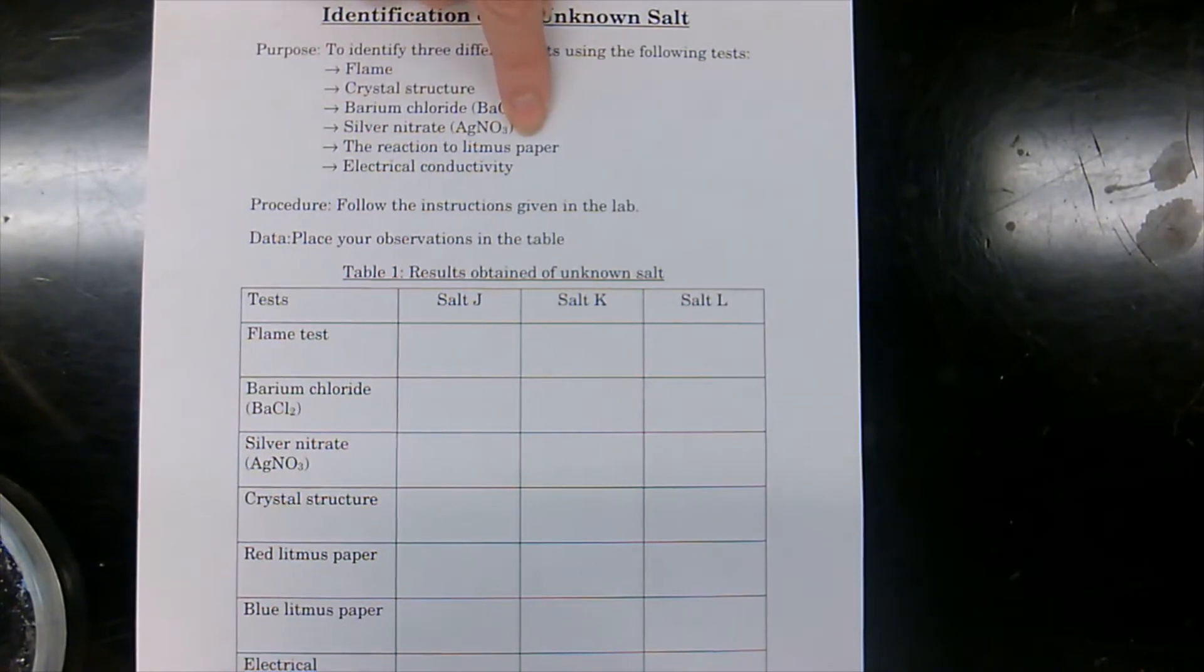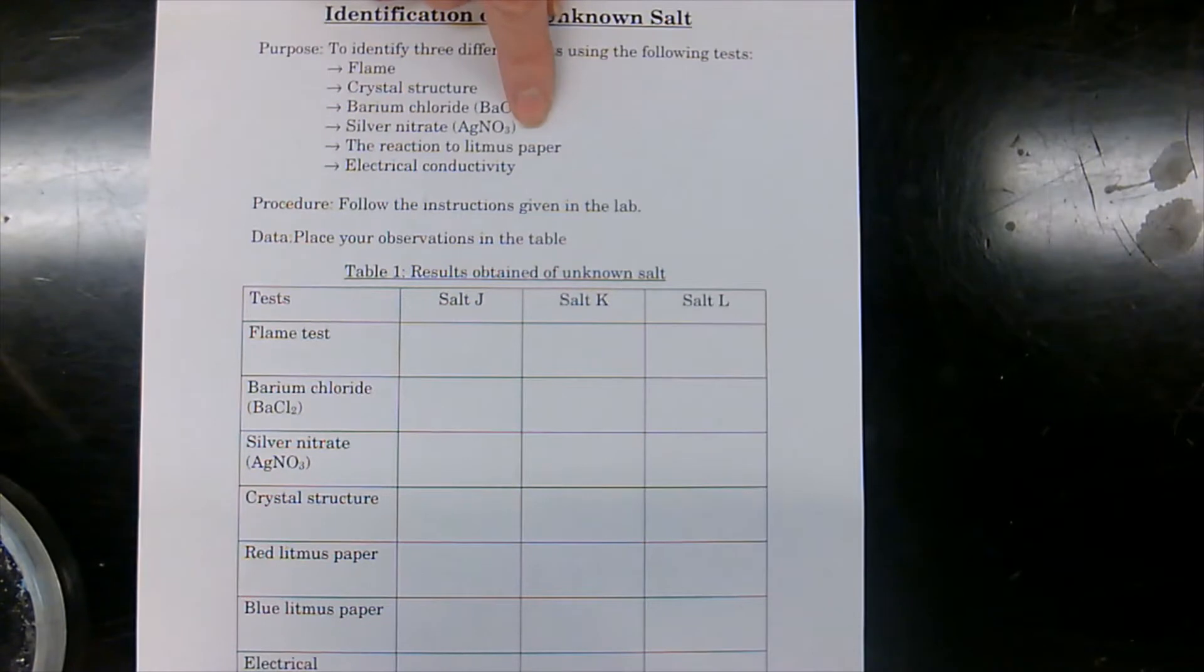We're going to be doing litmus paper testing. So this one we've seen before, red litmus, blue litmus. Red turns red, stays red or turns blue. Blue turns red or stays blue. Depending on which one it is, it's going to be either an acid, a base, or a neutral.